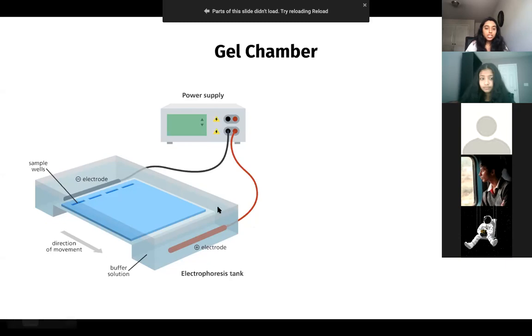And there's this positive electrode right here. Your DNA is also attracted to the positive electrode. In our lab, we use this saying called "runs to red." Whenever you set up your gel, you want to make sure that your DNA well is running towards the red positive electrode. If you accidentally flip your gel, so let's pretend that this part right here was the positive electrode, your DNA is going to be attracted to that and it's going to basically run off the gel and you're not going to see any bands. This is why it's really critical that you put your gel in the right orientation.